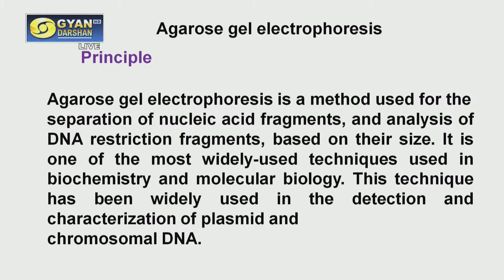How the plasmid DNA will look like, that you have to visualize. Whether you have isolated properly or not, how will you check that? You will check that through agarose gel electrophoresis. So this is the immediate experiment that will follow after plasmid DNA isolation.